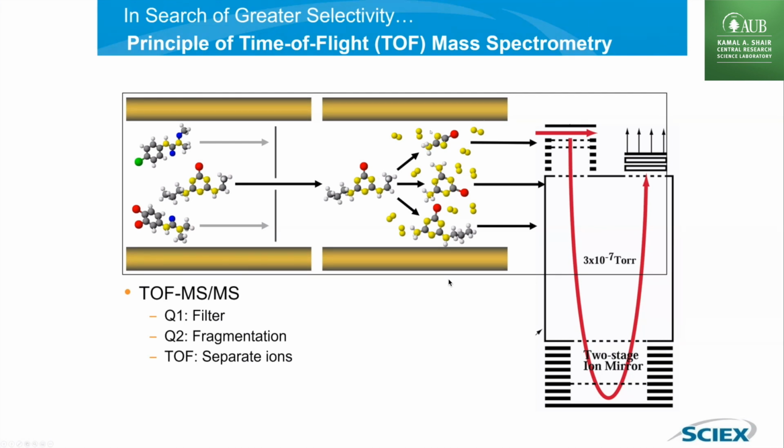You can see it's breaking into different daughter ions. And then in the time of flight, we make the accurate mass measurement of those daughter ions. So MSMS just means we're selecting a parent, we're breaking it in the instrument, and we're looking to see what those daughter ions are. What are the pieces of the main parent.